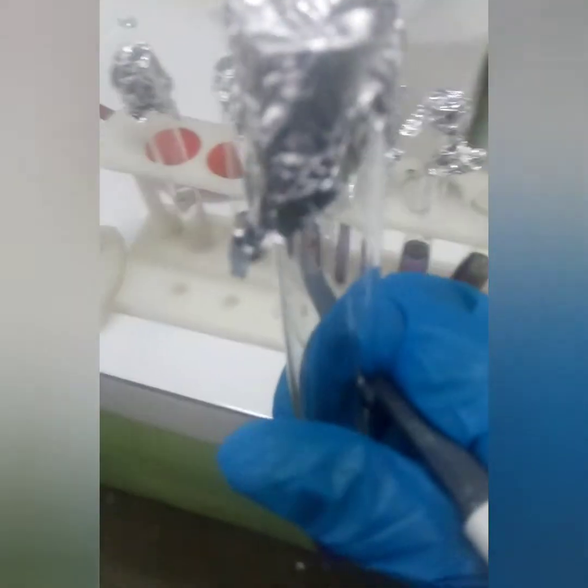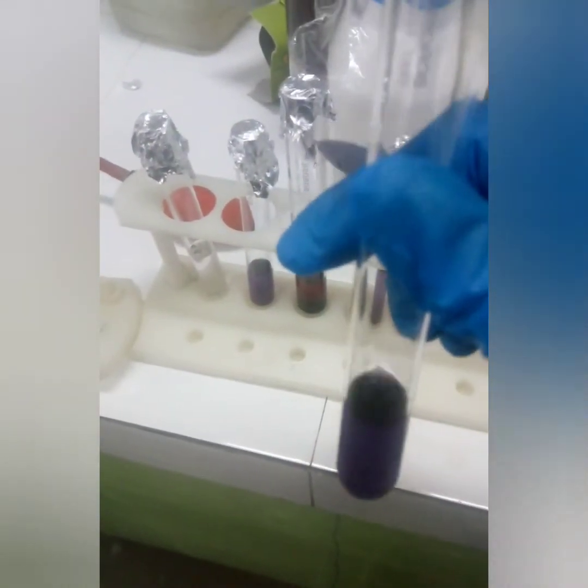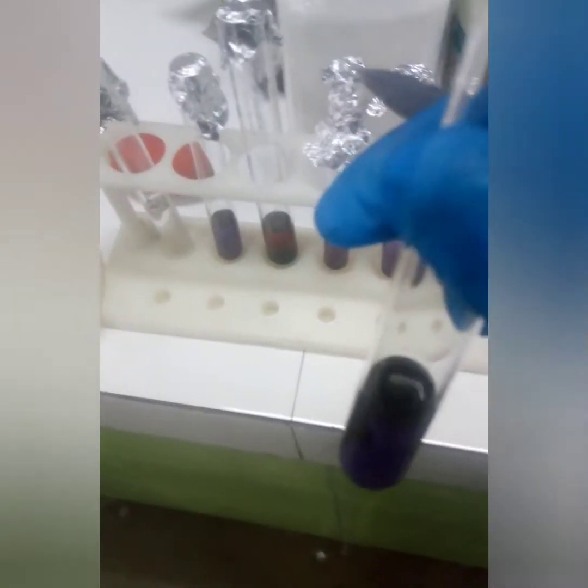And we need one more test tube with the unknown amino acid. Here we will add amino acid, and you don't know its concentration.